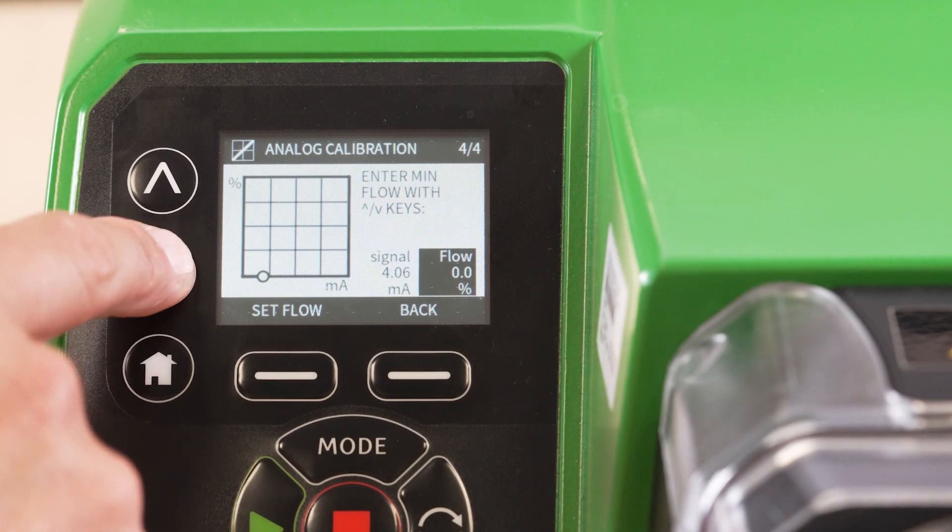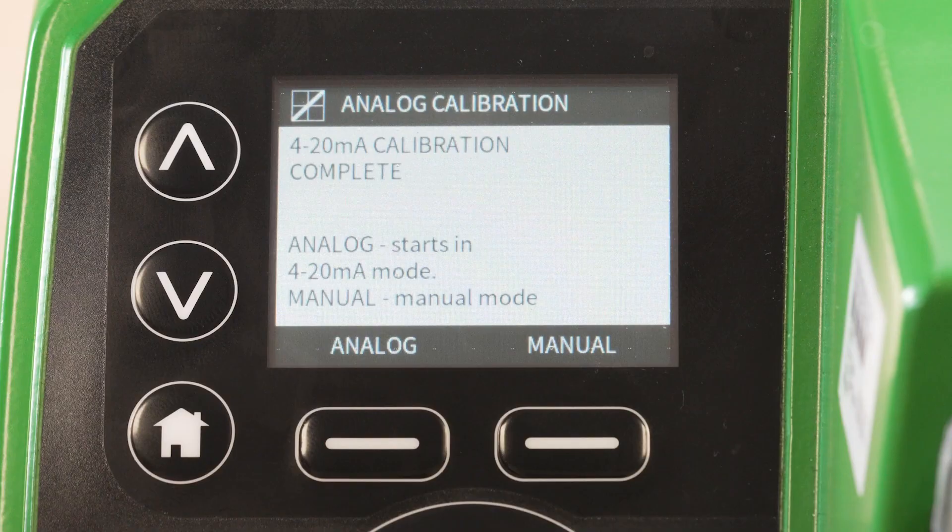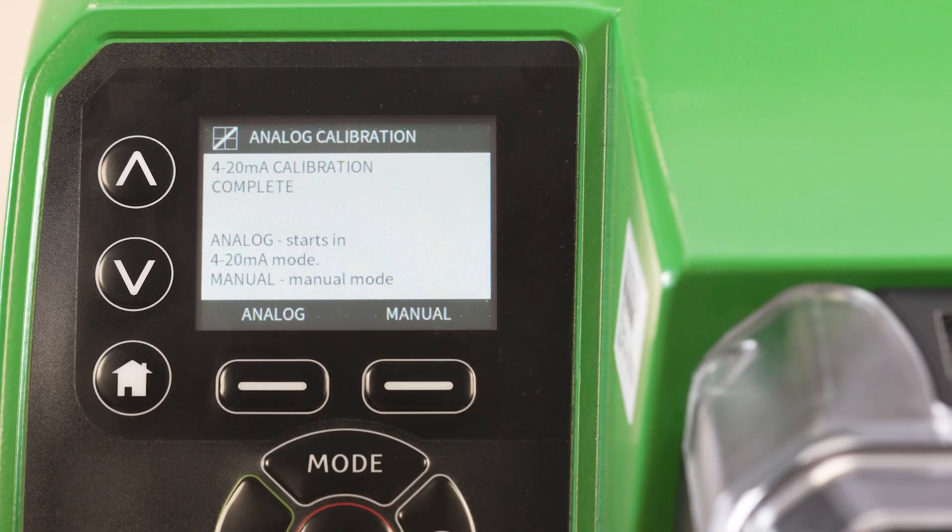Now the calibration is complete. You can select analogue to run analogue mode. Depending on your calibration, the pump may start to run at this point.